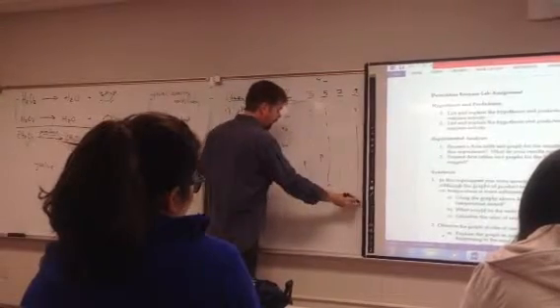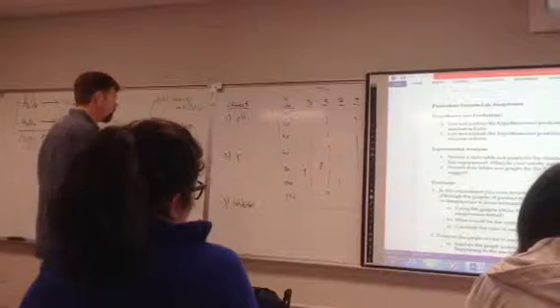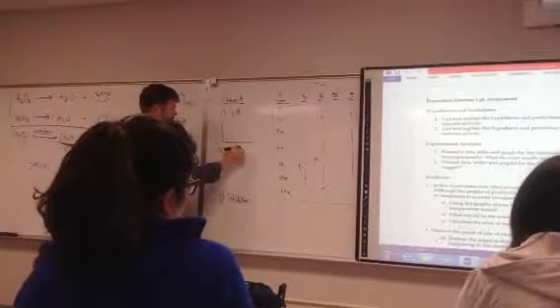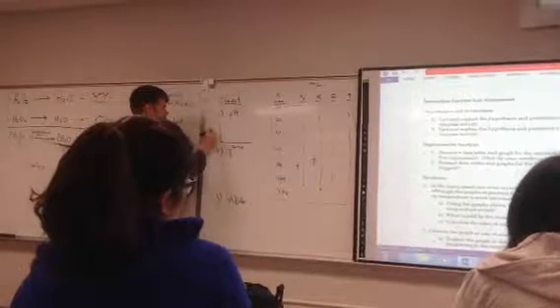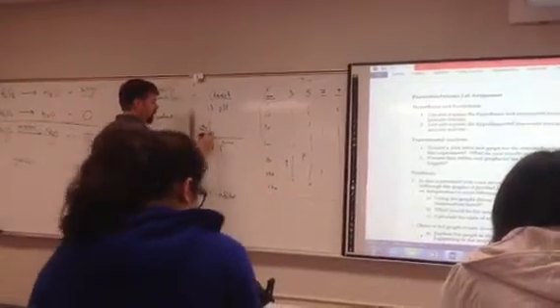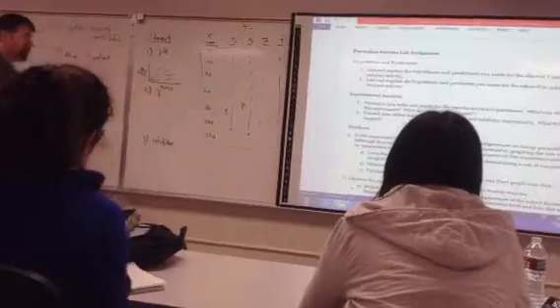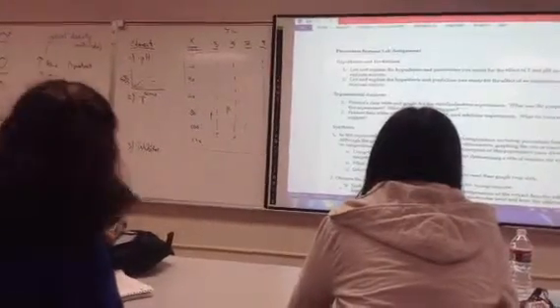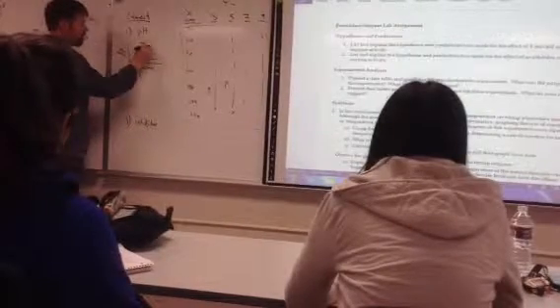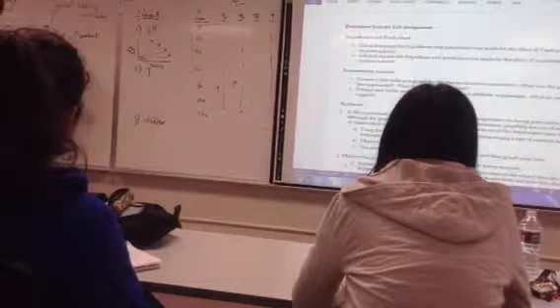And then if you graph this data table, either by hand or on Excel or whatever, you should be able to produce a graph that looks like this, that has time as the independent variable, and absorbance, with units of ODUs here, as the dependent variable. And we did 4 treatments, so we have a graph with 4 lines. And this could be pH 5, 7, 3, and 9, or something like that. Does that kind of make sense?